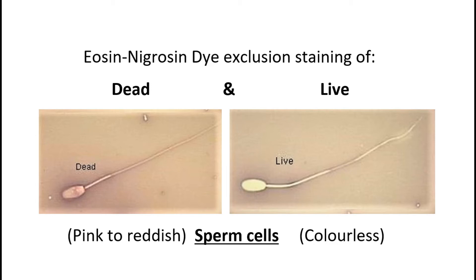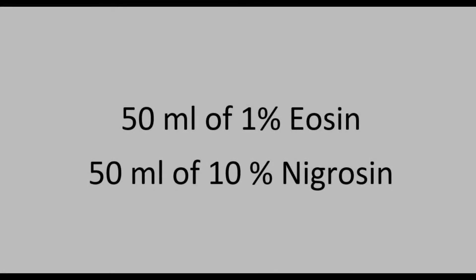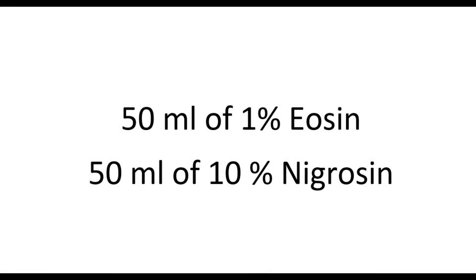In this video, we'll go through the step-by-step process on how to prepare ready-to-use eosin and nigrosin stain solutions in the lab. Specifically, we'll be preparing 50 mils each of 1% eosin stain and 10% nigrosin stain solutions, which are the most widely used stain concentrations for sperm viability test.